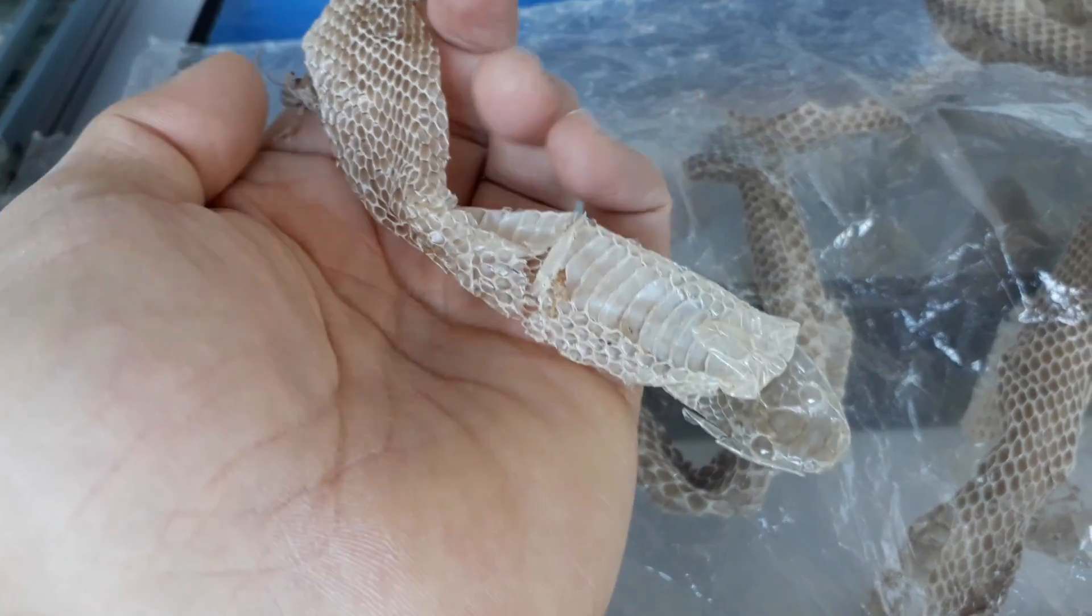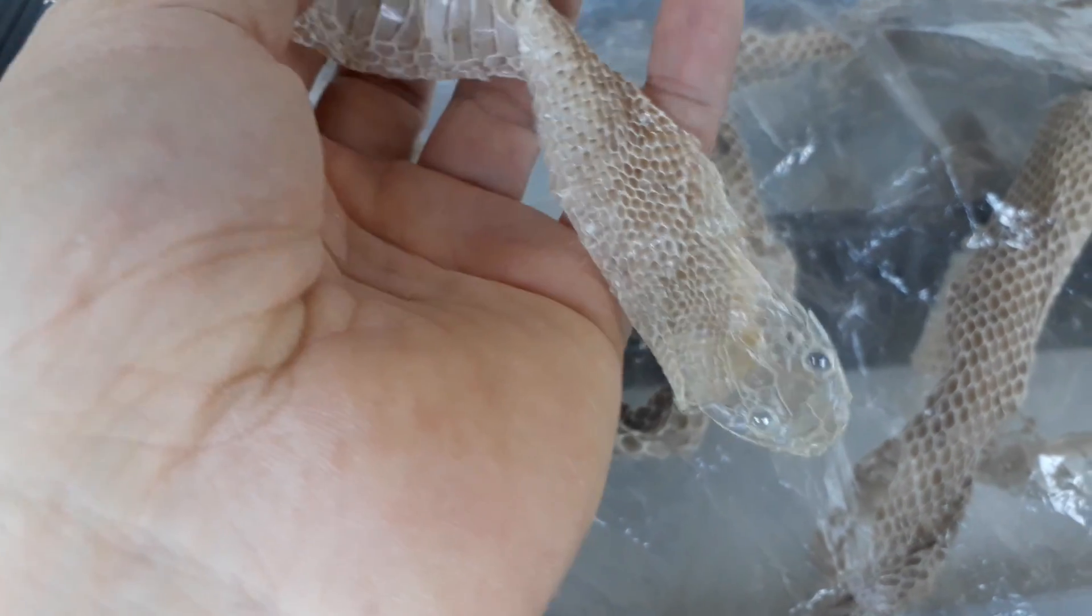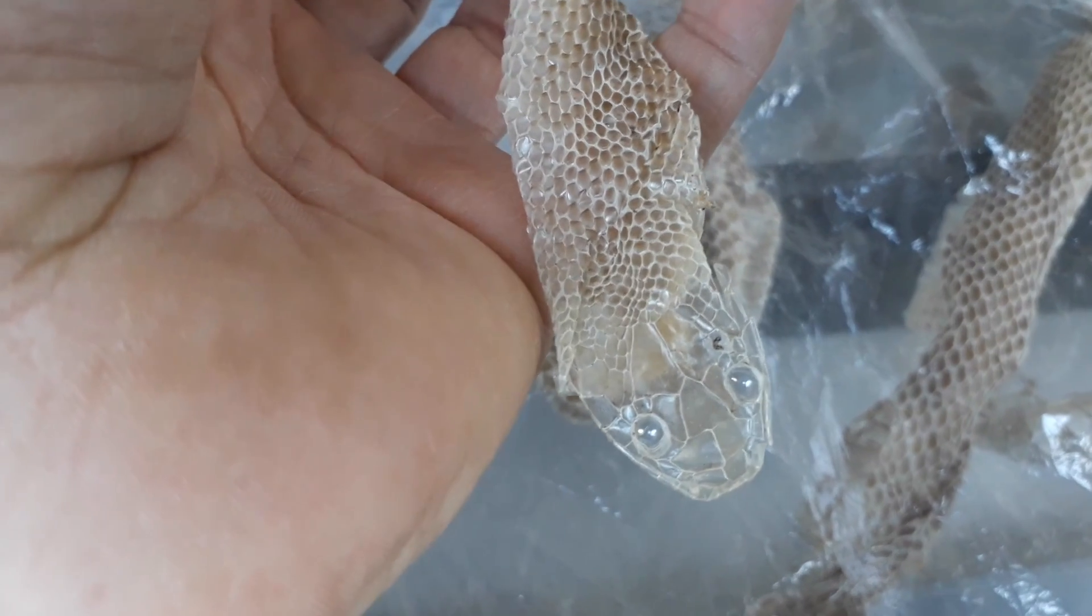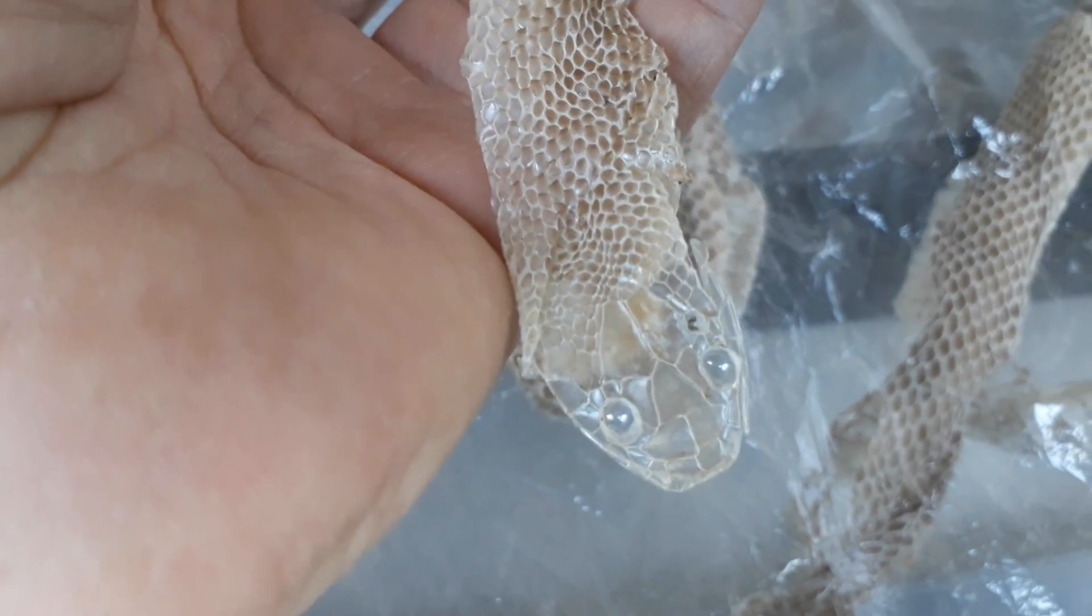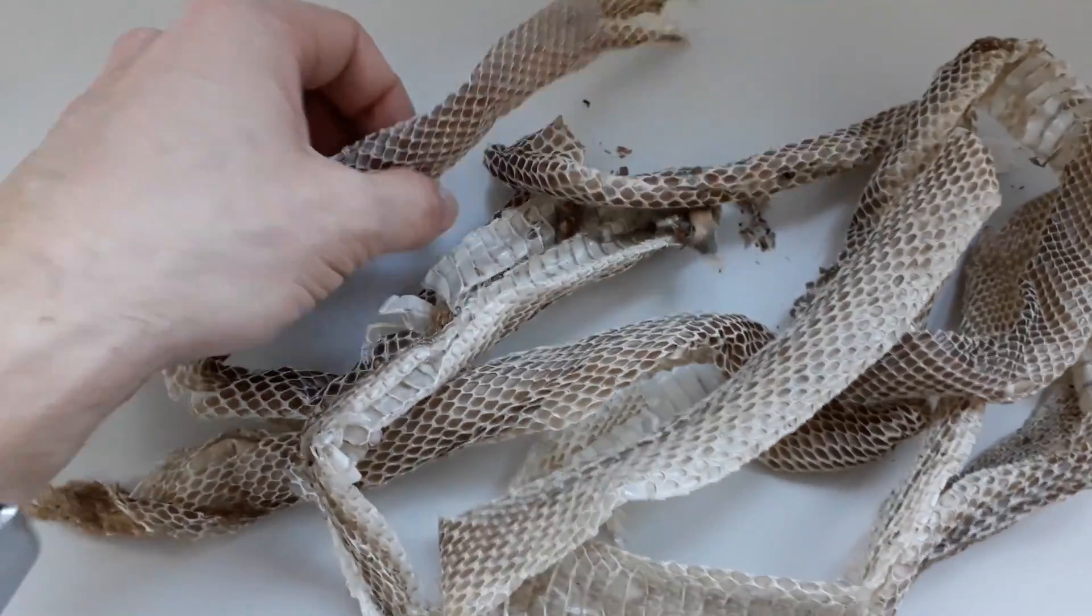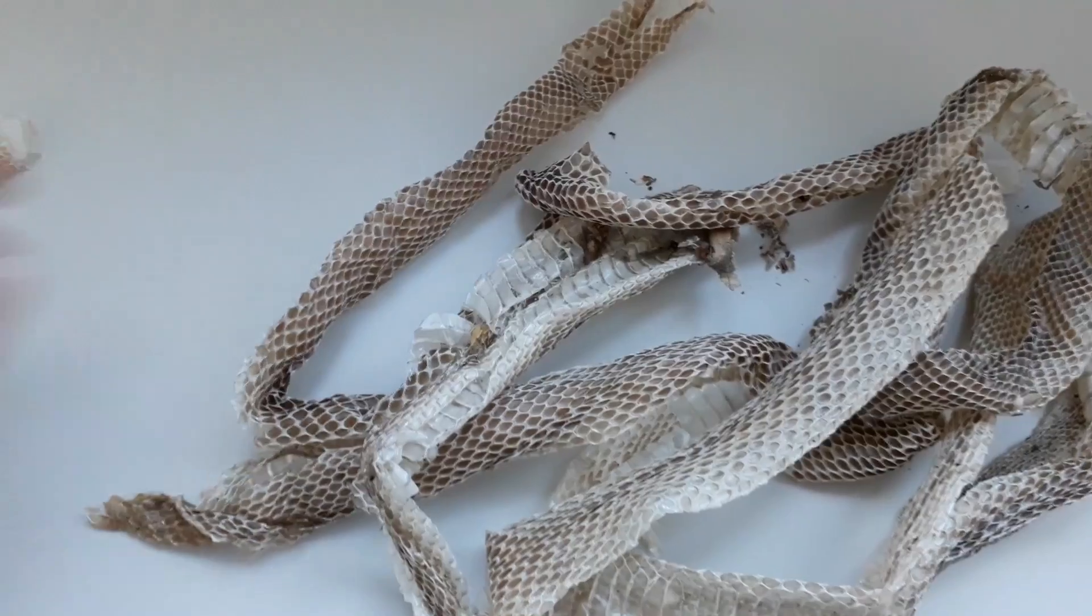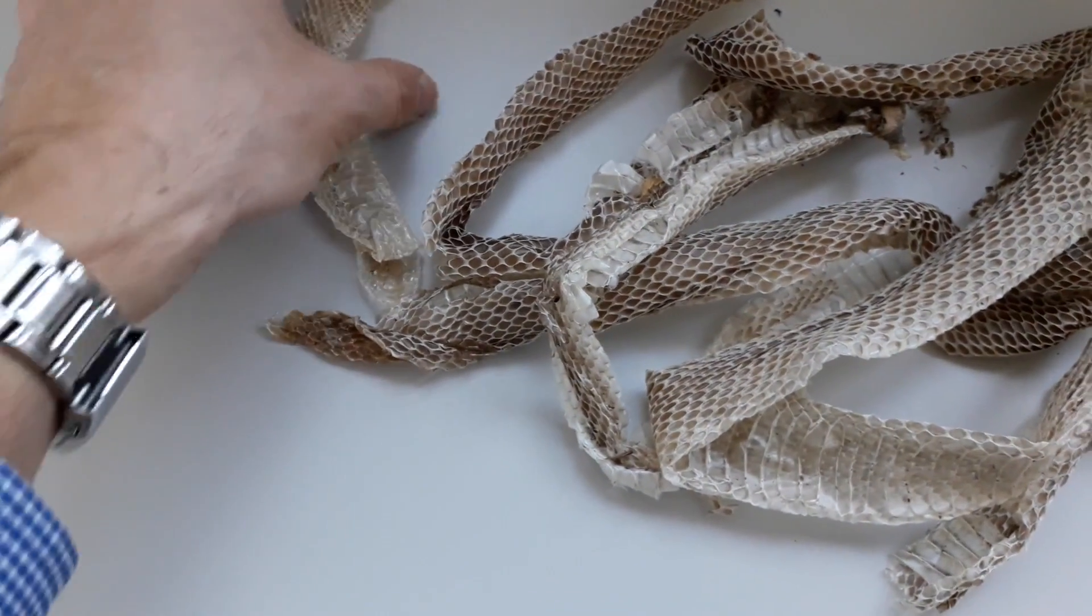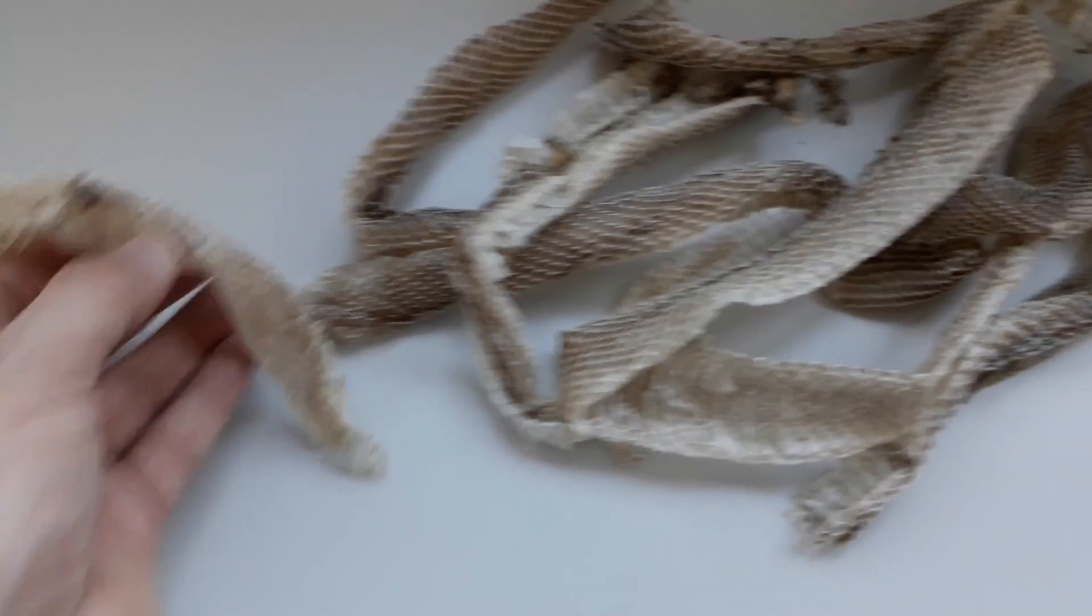If you're lucky enough, you can find snake skin like this in the forest. When snakes grow and their skin becomes too tight, they shed it off. A few years ago a student found this pretty complete snake skin in the forest.